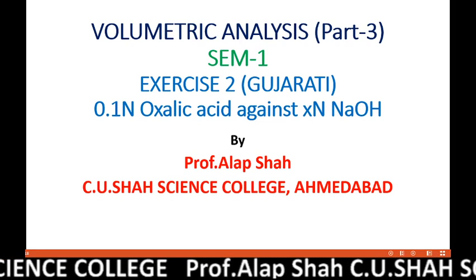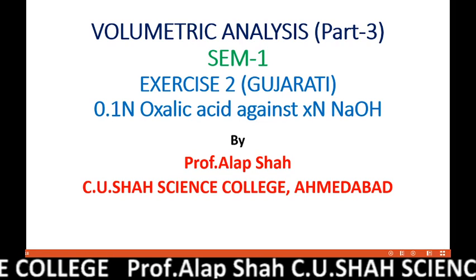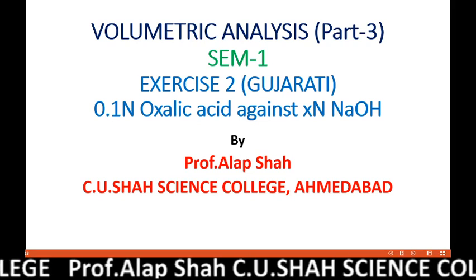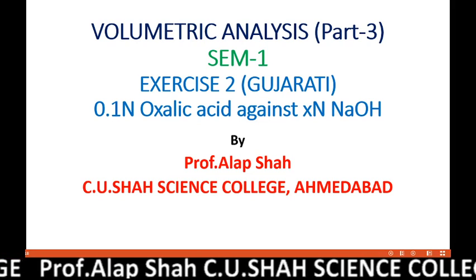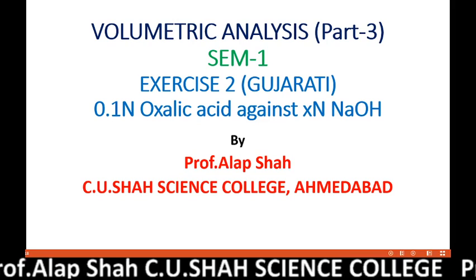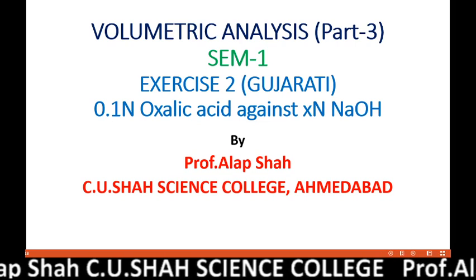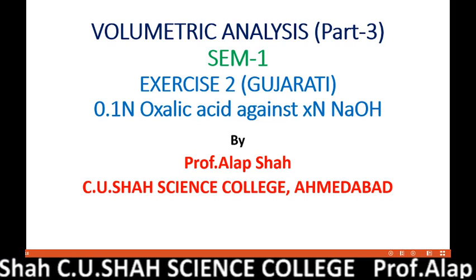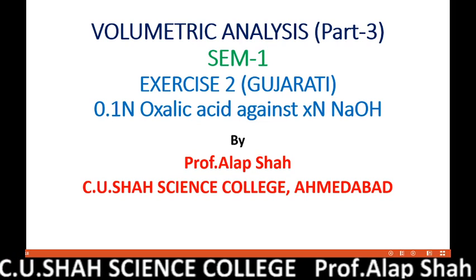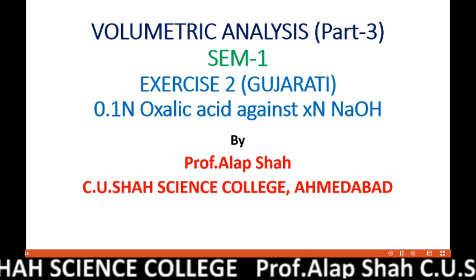There is one more exercise, almost similar. A few differences are there that we will discuss in this video. That is oxalic acid against X normal NaOH. Both exercises are between a weak acid and a strong base. Both succinic acid and oxalic acid are weak acids. NaOH and KOH are strong bases. So first of all, the main difference is the preparation of standard solution because the weight would be different.